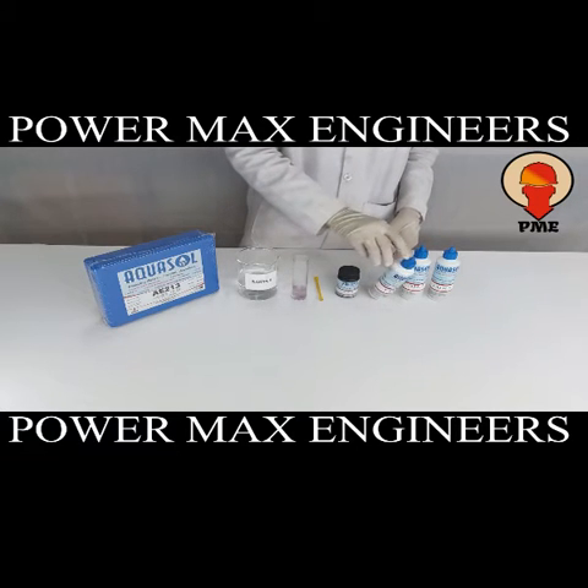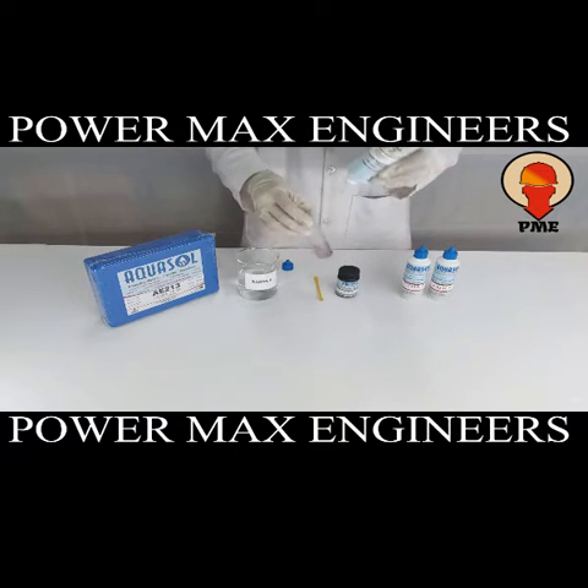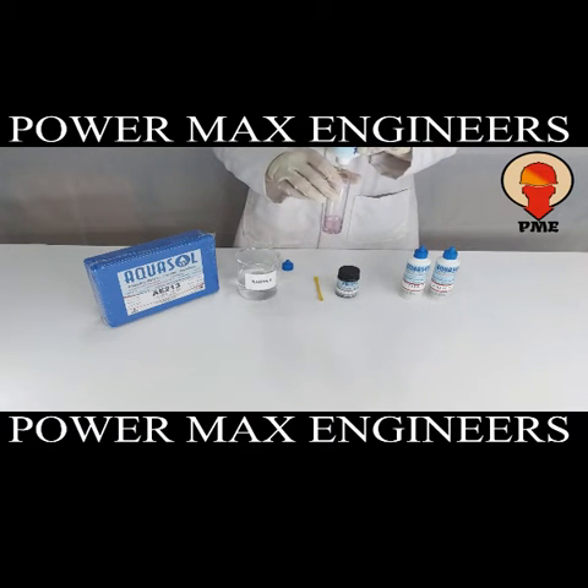Now add CD2 drop wise until the sample turns yellow. Mix well.